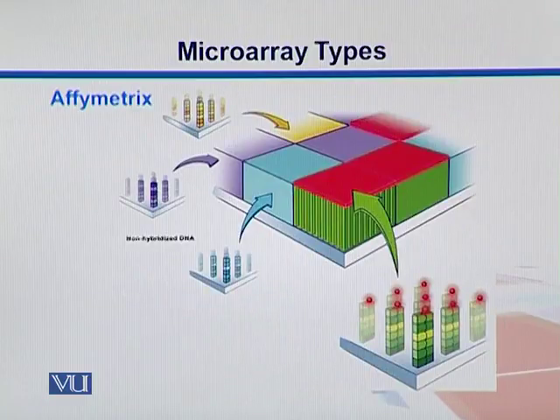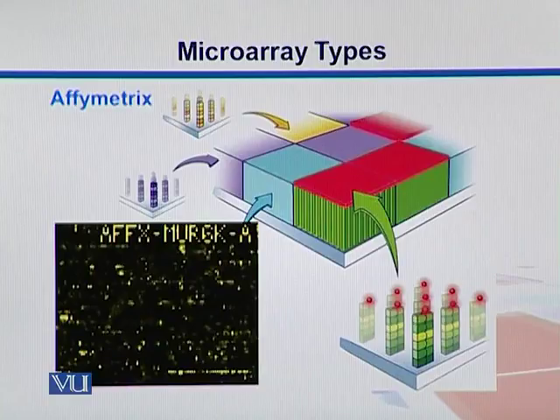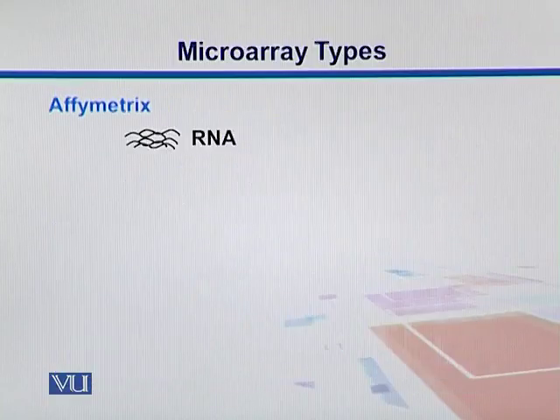So here we see that we have a large number of red spots. Red are where we have hybridizations. We do have some areas like blues or other colors, which are the spots where we did not see any hybridization.